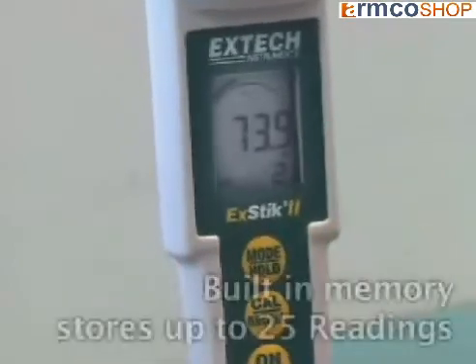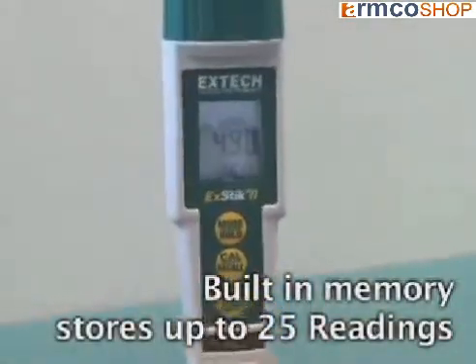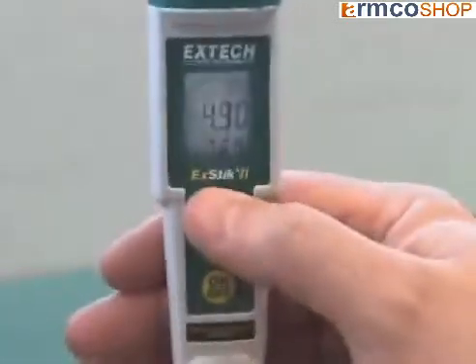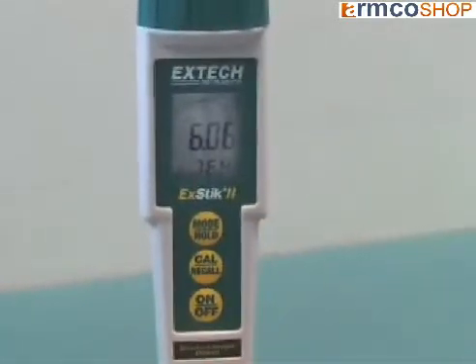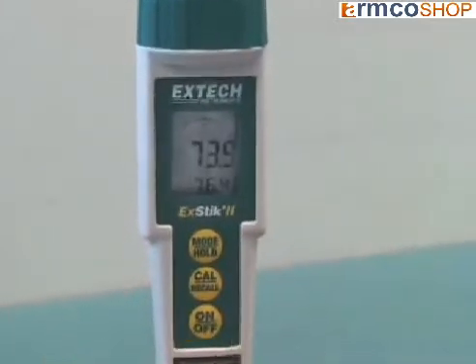The internal memory allows for data recording of up to 25 readings that are labeled sequentially for easy recall. This feature eliminates the need to bring samples back to the lab. It not only saves time, but also provides maximum accuracy for on-the-spot data recording.